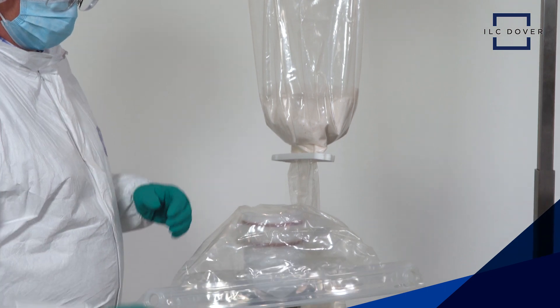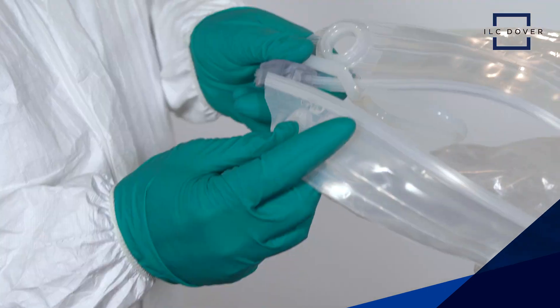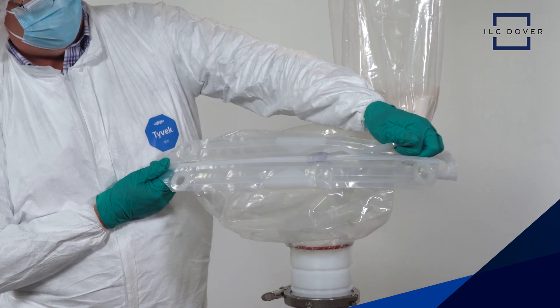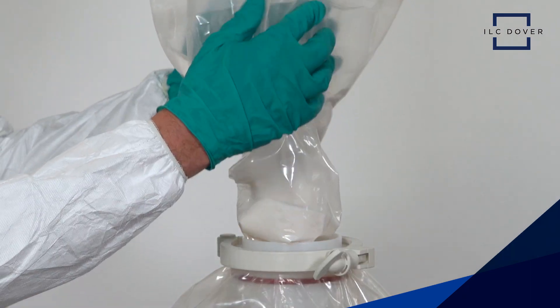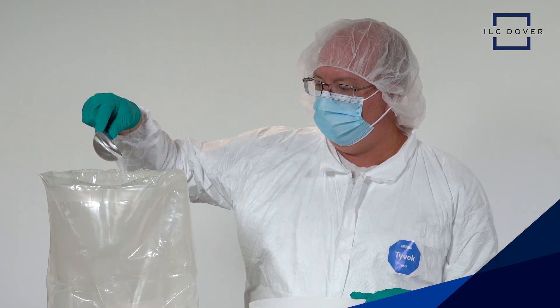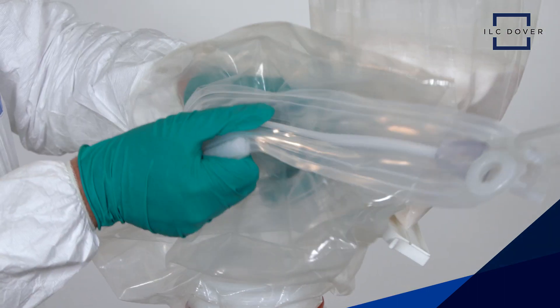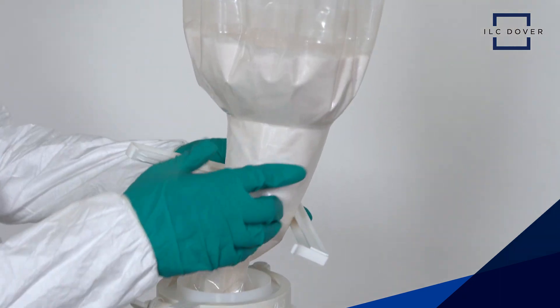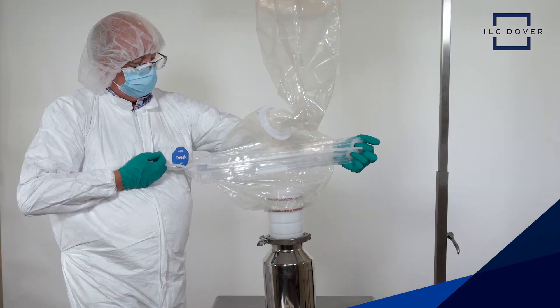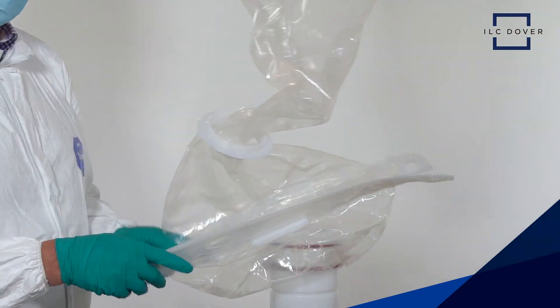The EZ Biopack Zip integrates market-leading, purpose-built, single-use EZ Biopack powder handling bags with upper and lower zippers to facilitate seamless powder transfer with easy fine-tuning of precise target weights in a controlled, closed format. ILC Dover's EZ Biopack Zip is the ultimate solution for handling dry powders for media and buffer preparation during drug development and manufacturing.